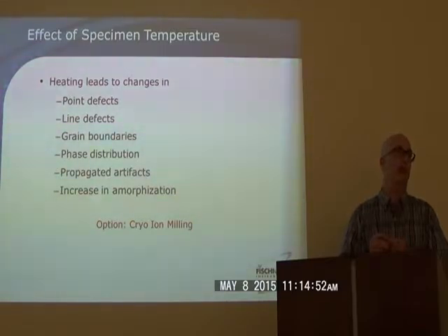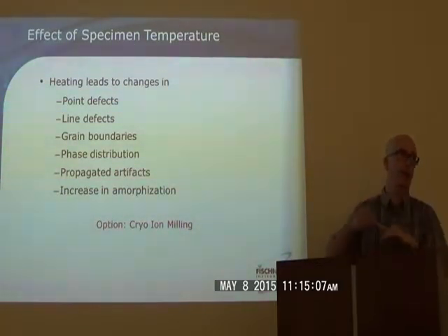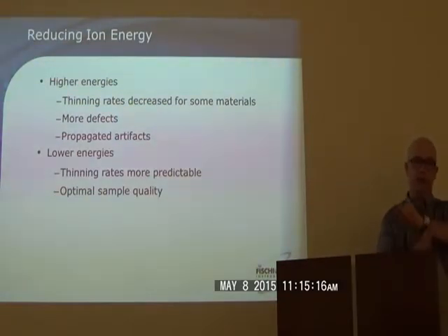But what about the redeposition somewhere? Well, sure, redeposition can occur. I guess the idea is that if we're only working on one surface and we only have one set angle, I wouldn't expect redeposition to occur. If we had, for instance, different geometries, we'll talk about that a little bit more in a minute.